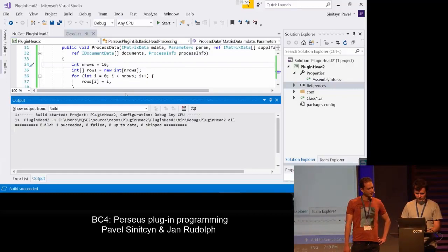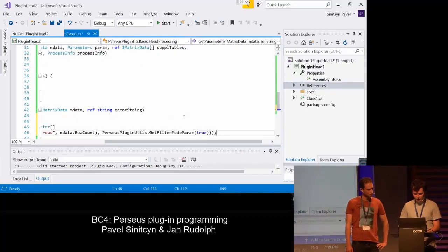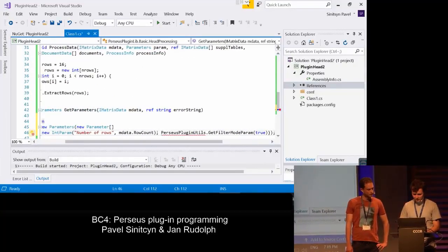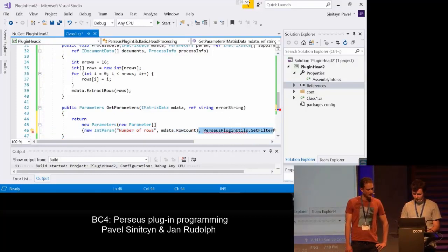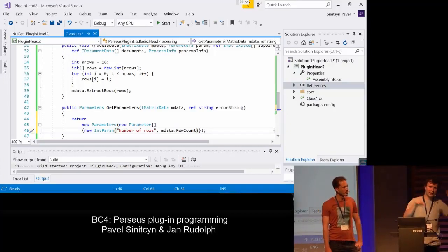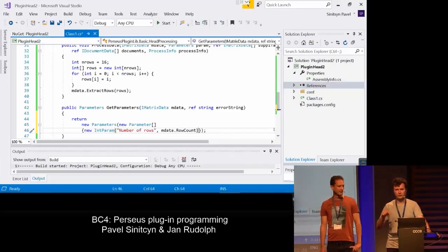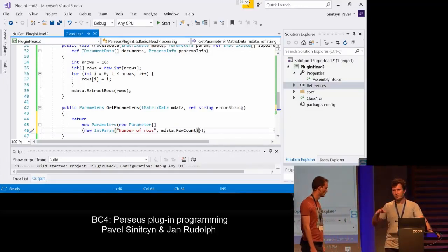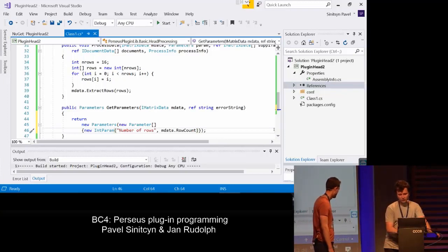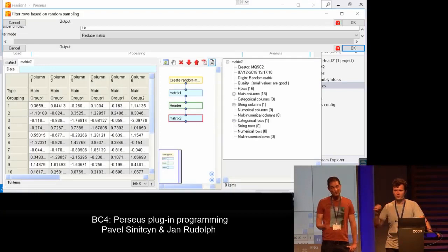And insert where? Insert exactly in the get parameters. Okay, let's first of all delete it. Let's remove the last one. I don't think we need it for now. If I speak more seriously, at the moment when you're clicking on the activity, this function is going to be called first. But when you specify all parameters and click OK on this activity, the processing function will be called.